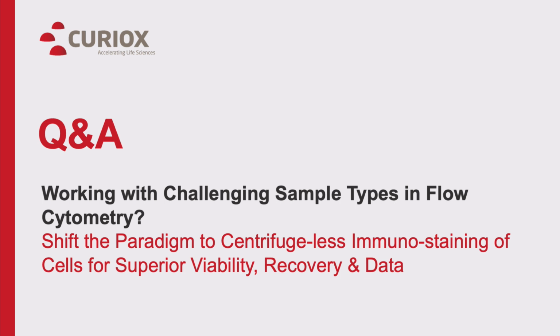Thank you. How many 96 well plates can you automate with the Laminar Wash Auto 1000? That's a good question. I believe the plates are done one at a time, and I think you can put a plate loader onto that. I am not as familiar with the auto system right now. I'm just coming up to speed on the 2000, so I'm kind of speaking out of turn here. I don't know if any of my colleagues from Curiox could answer that question in more detail than I can.